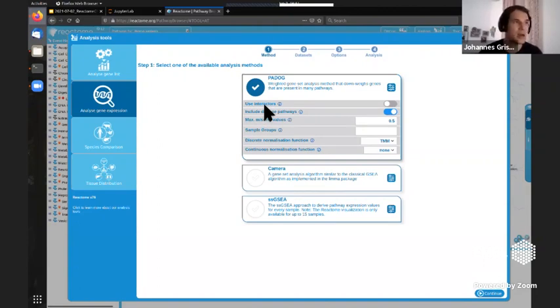If you enable this option, we use protein-protein interaction data from IntAct to enrich the Reactome pathways. Since Reactome pathways are manually curated, we don't have information for every gene or protein, but here you can automatically add close interactors to the pathways. I'm not going to do this now, I'm just keeping it simple. Everything else I'll leave as default, and I'll just continue.